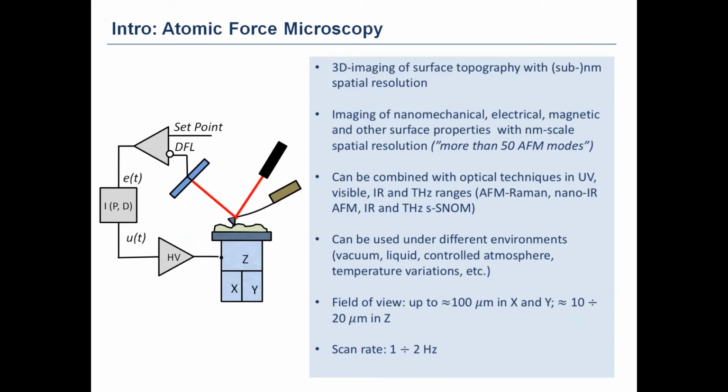Well, the atomic force microscope was proposed more than 30 years ago. It was in 1985 when Binnig, Quate, and Gerber introduced the first instrument, and since this time atomic force microscopy has been widely developed. At the moment there are a lot of AFM methods available, and a lot of instruments are commercially available, supplied by a number of companies offering high-quality AFM instruments.